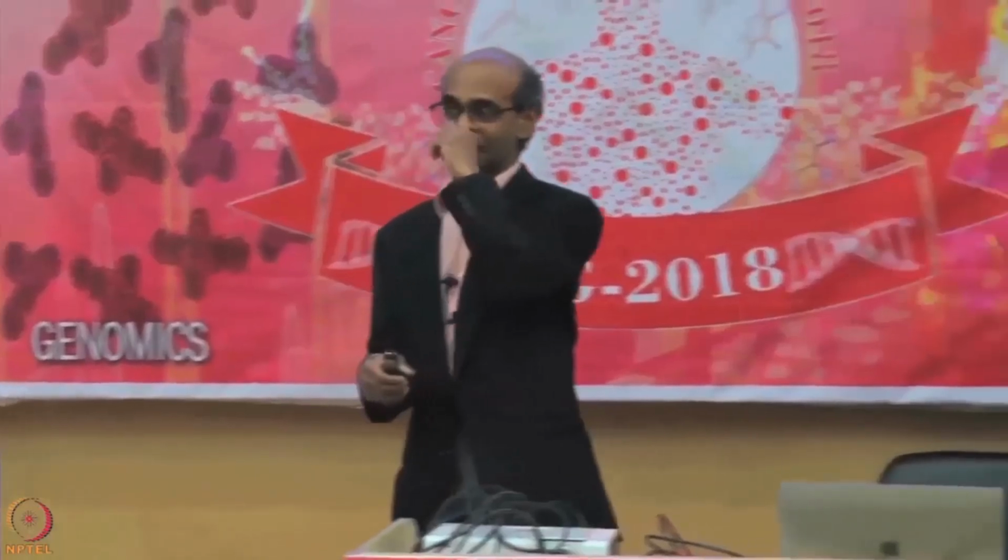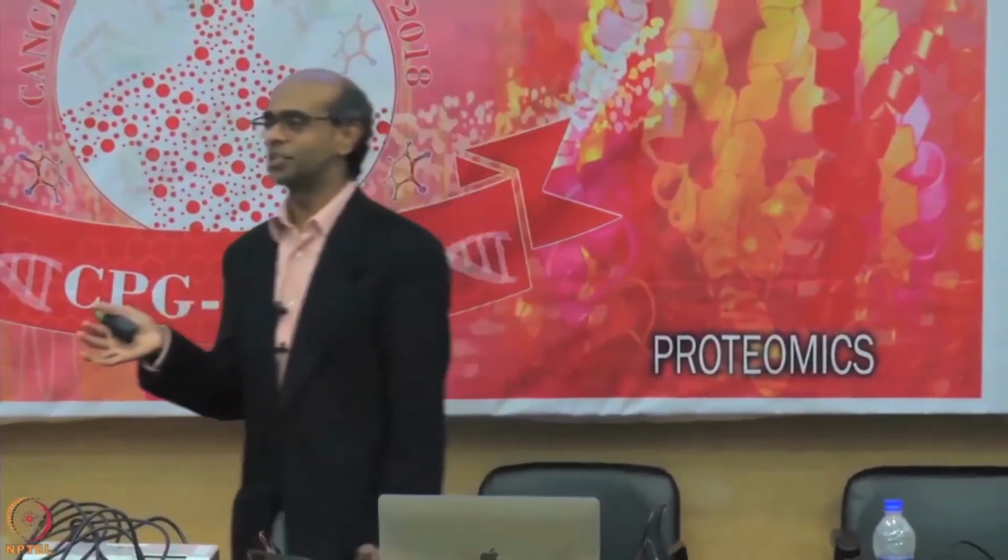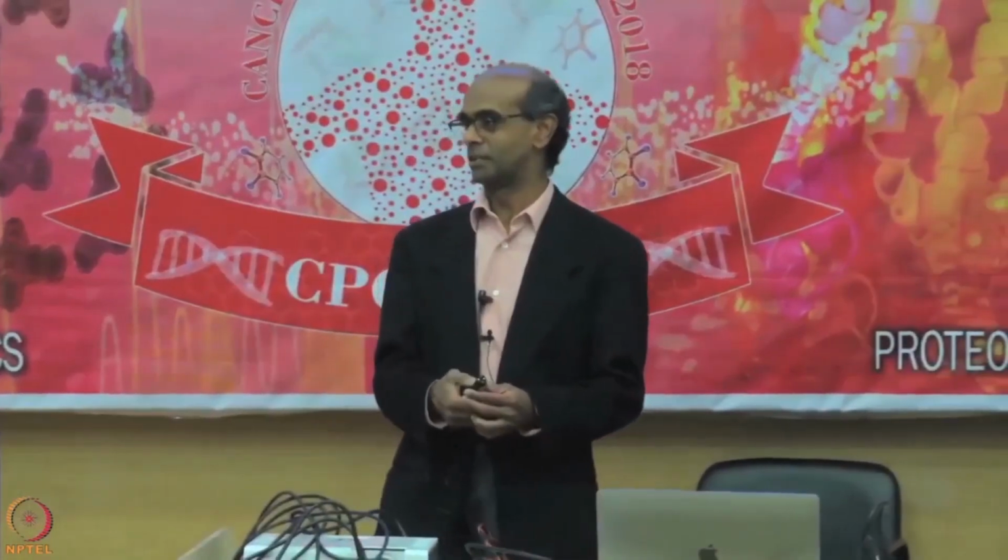The whole purpose of that is you have peptides or proteins that you are interested in, that is your signal. So, things that are different between your different types of cancer, or between cancer and control, that you are interested in. Things that are really different are called signal, because that is what you are looking for. But because of the measurement process and primarily technical variation, there is a lot of noise introduced in your data. The purpose of normalization is to minimize noise and maximize signal.